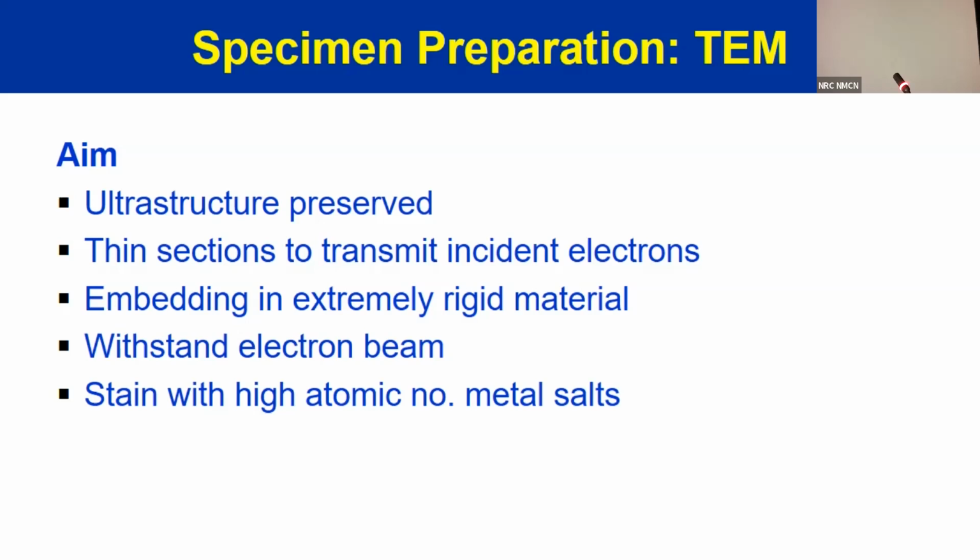After that, sectioning before processing. So you go through a lot of processing steps, and then it is embedded in what? It is embedded in paraffin, and then you cut sections and look at, remove the paraffin of course, and then you stain it and look under the light microscope. So it is paraffin embedded. So that is known as formalin fixed paraffin embedded. That is easy. But can we use the same procedure for electron microscope?